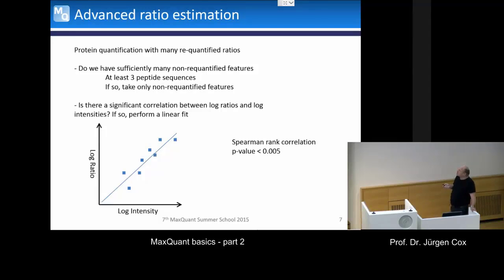So that's basically as far as we can go. You don't want to extrapolate, because you don't really know where to stop with the extrapolation. But that's what we can claim: the tightest constraint that we have on the ratio, right? The ratio has to be at least that big or higher.